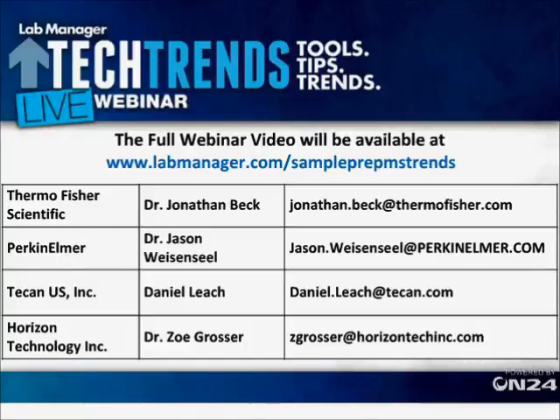This is Jason. Yeah, generally dilution is the way to go, but you may also do a multi-step approach, where you do a liquid-liquid extraction with, say, a strong organic solvent, and then follow that up with a solid phase extraction to clean that up. But in general, I think dilution is the most common way to deal with viscous samples.